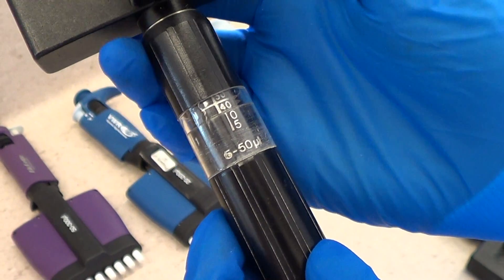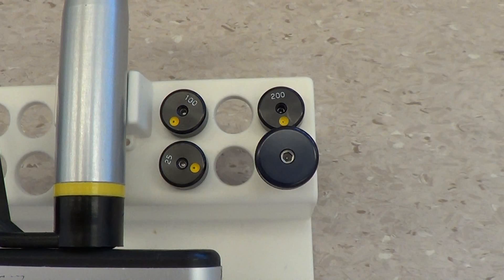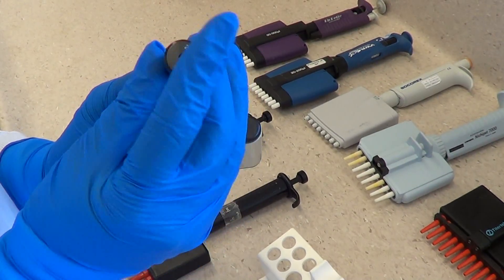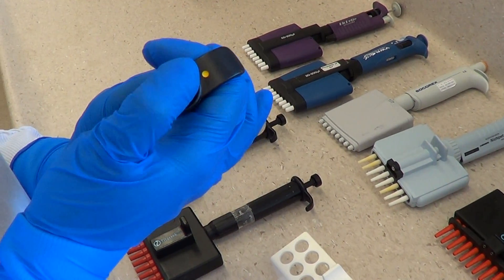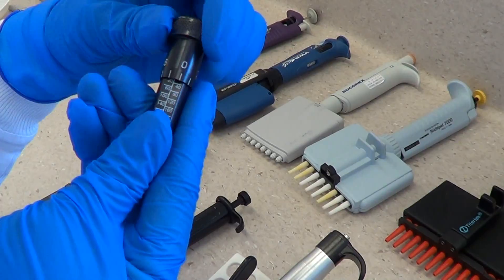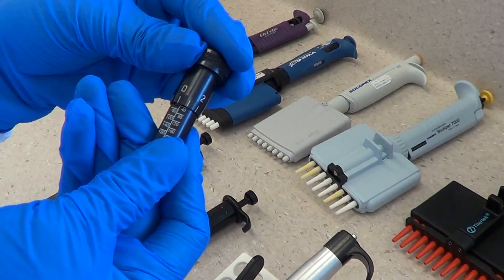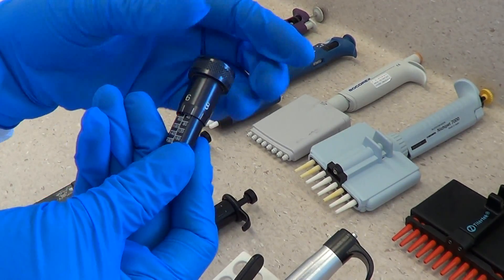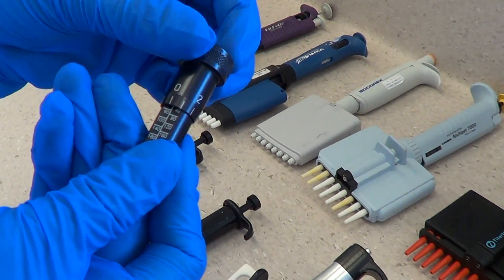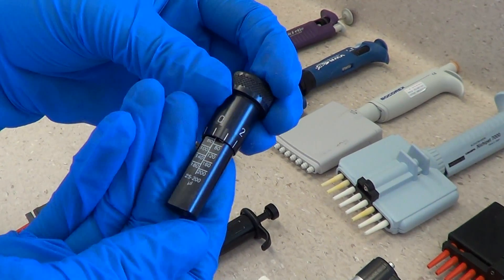Setting the volume of the Micronic multi-channel pipette. This pipette is set to 40 microliters. The Micronic pipette has a selection of plungers with preset volumes; this pipette is set to 25 microliters. There is also an adjustable plunger — set the plunger by screwing the top up or down. This pipette is set to 60 microliters.